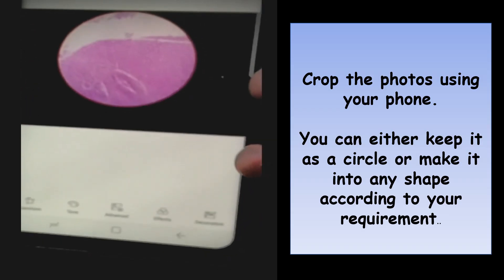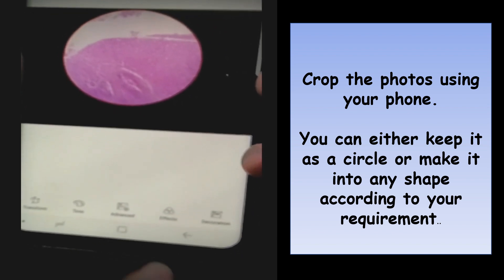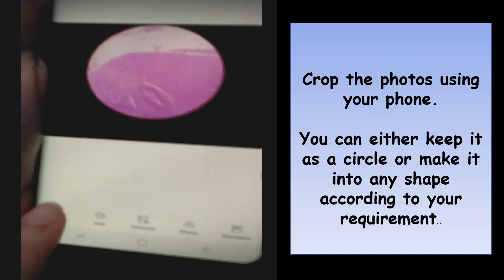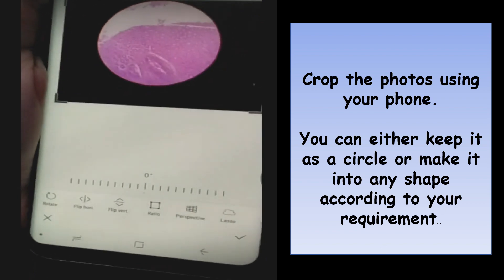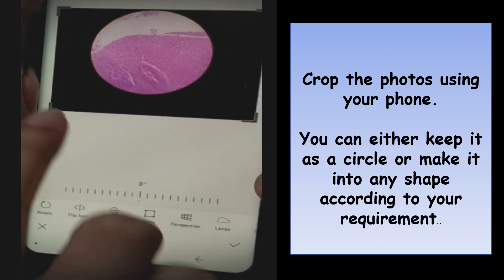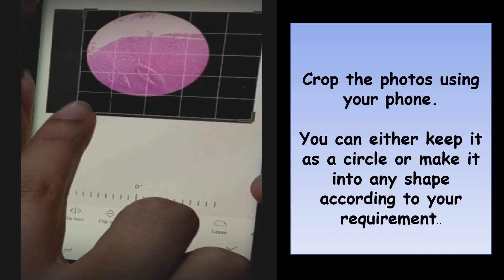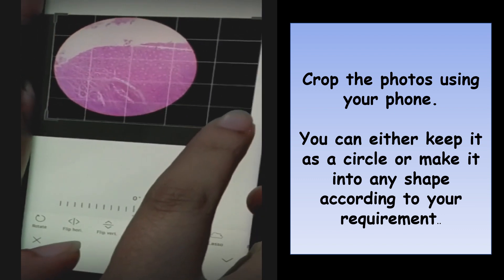Once you take the image, you can keep it as a circle or crop it, preferably crop it. It can be done on your mobile or on any of the image editors you get on your laptop.